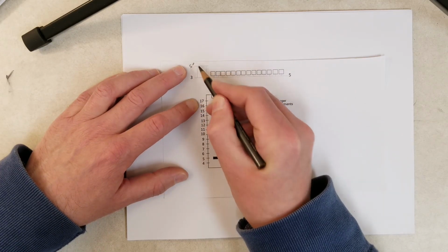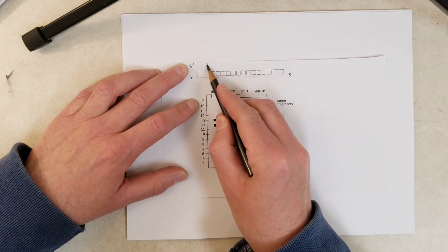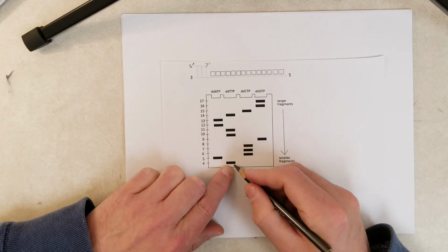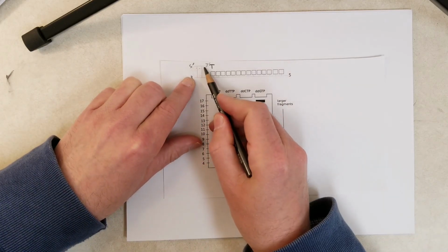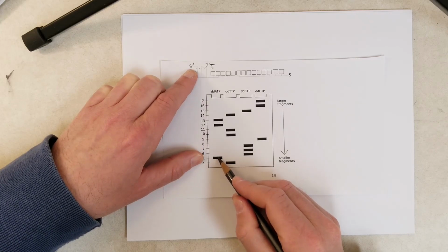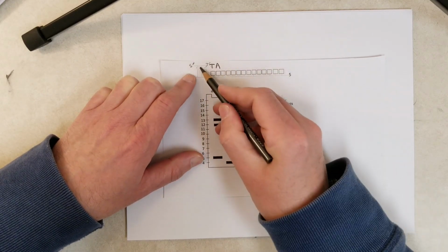Now primers, I didn't show you the sequence of the primer, it doesn't really matter, but primers can only be extended from the 3' end in the 3' direction. So we know that's the 5' end, we know this is the 3' end. So look at the shortest band. We should put a T right here. Well, that is 4 nucleotides long, so that makes sense. We have 1, 2, 3, 4. Okay, how about this one? This DNA molecule ends with an A, because it's the dideoxy ATP lane, and it's 5 nucleotides long. So that makes sense. 1, 2, 3, 4, 5.